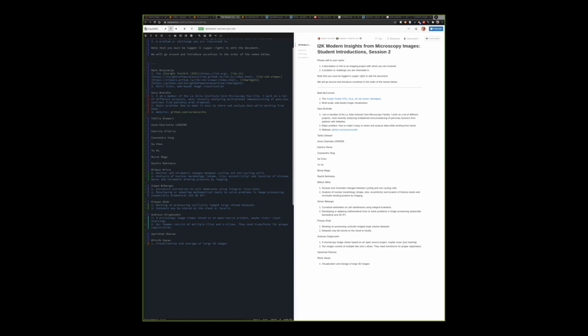Great. Yeah, I do a lot of work in image registration, and we're going to talk about OME-Zarr and N5 in a little bit. One of the things I've been talking about with other folks in the community is the metadata that's important for registration related to spatial location, the spatial location of images relative to one another, which is very important for registration and also for multi-scale imaging.